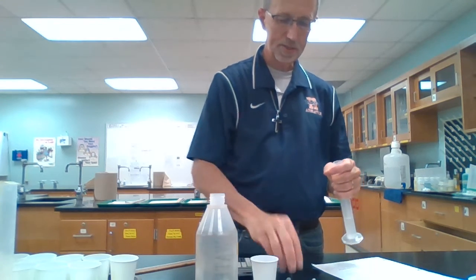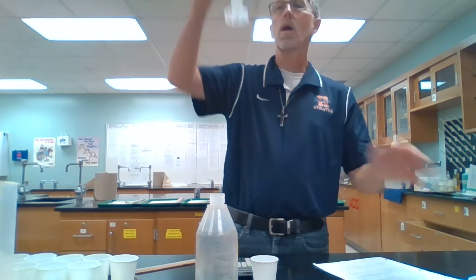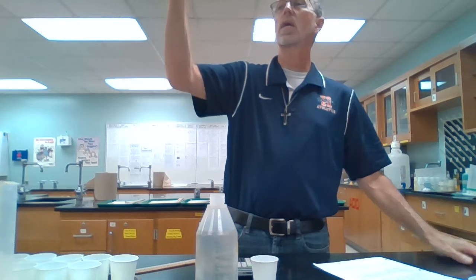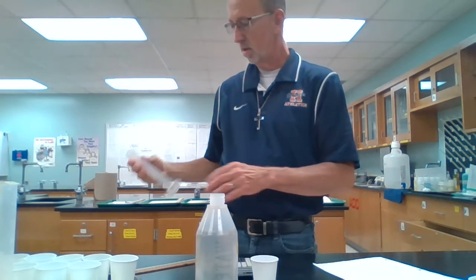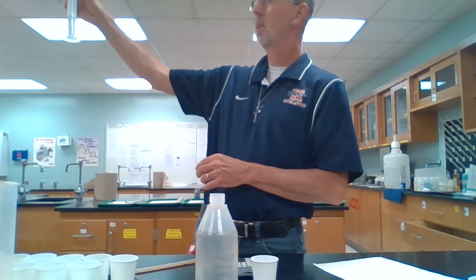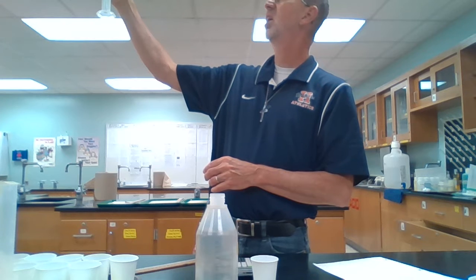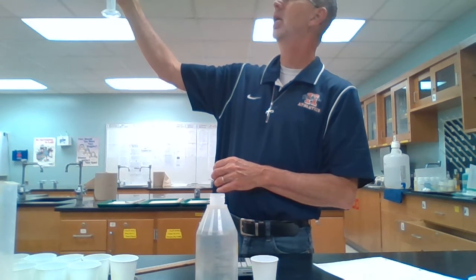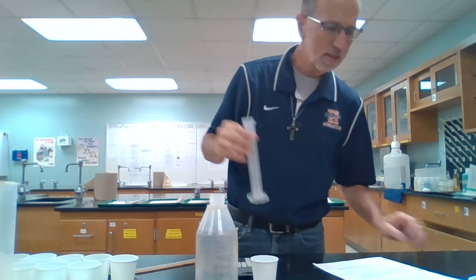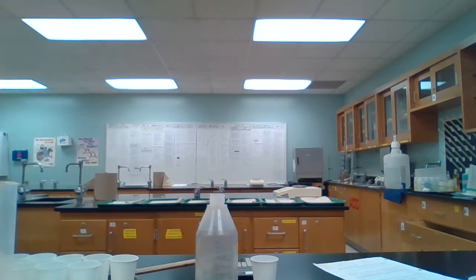Well, I thought it easier just to drop them in there. Get them all submerged. There we go. Let me do my little subtracting here. Looks like about 4.3 mLs for zinc number 1.